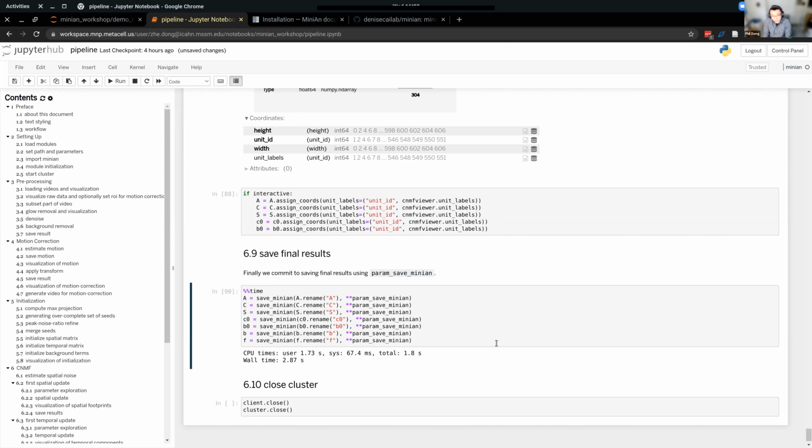We used to have a batch processing notebook, but I realized the complication in that is now really overweighting the benefit of it. So if I'm going to do this myself, I will probably adopt the same strategy as you. I basically convert this notebook to a Py file and put it in a for loop. I think the main difficulty of having something like that is how to handle different folder structures for people, and how to save the parameters they use.